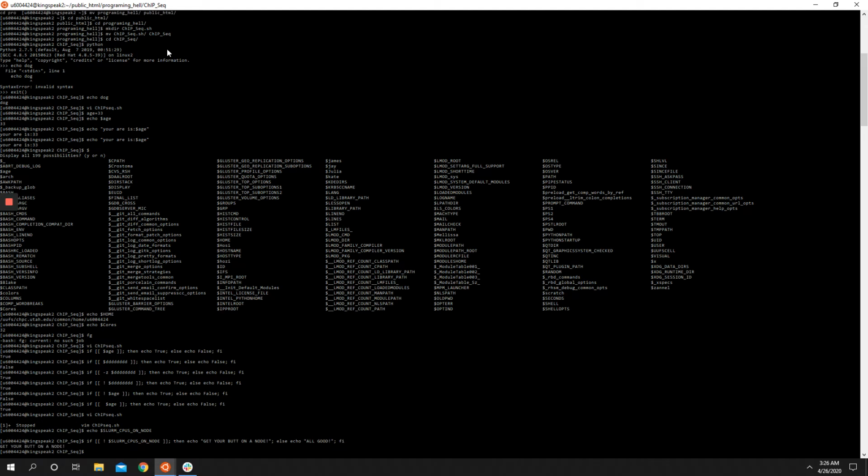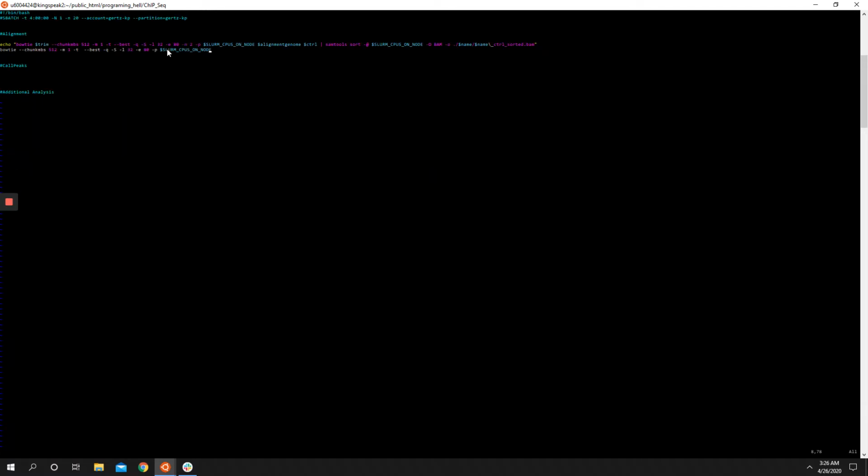And so we're not on a node, so we get our nasty message, and then you can exit the program. So okay, that's what that's doing, and then it's just saying use every possible core that there is to do this alignment. So for us, we would have done just something like 20, because that's how many we would have on one.